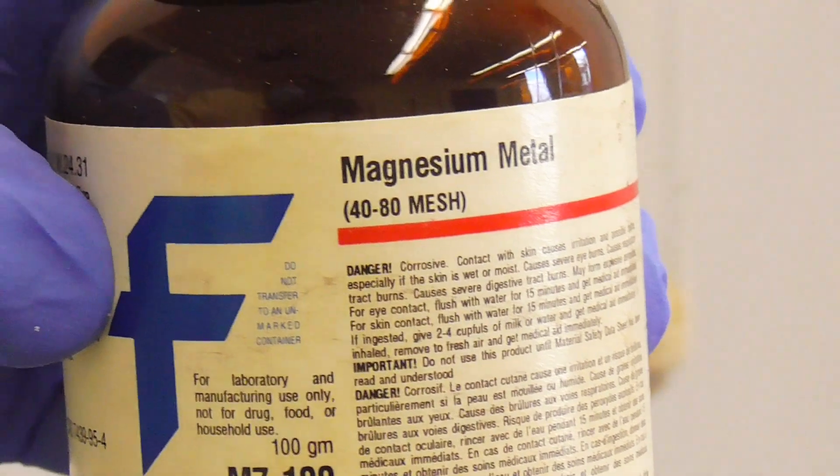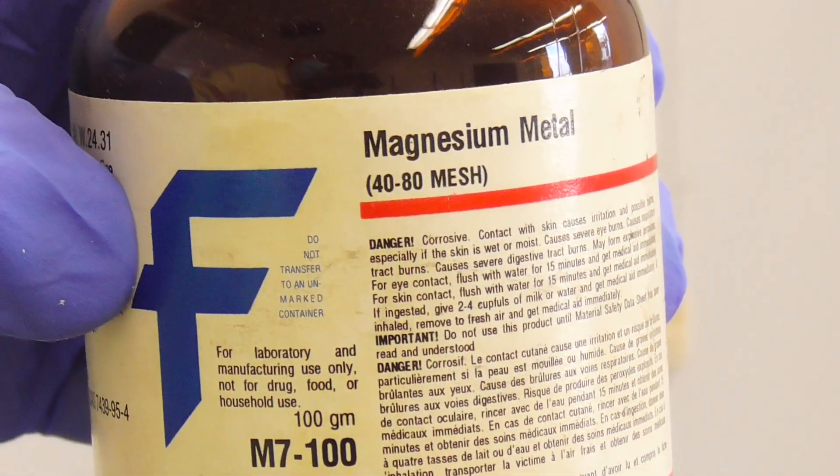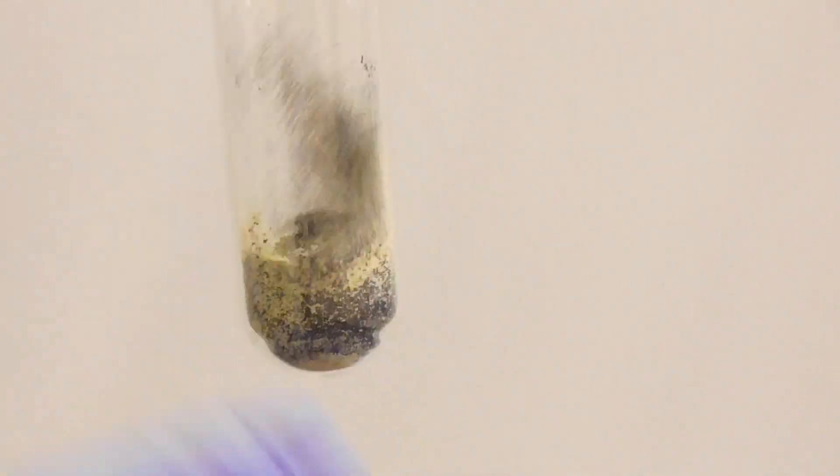I'm going to try to extract the element silicon from sand using magnesium metal. First, I'll add some granular magnesium metal to the sand in this test tube. After shaking the test tube to blend the contents, I'll heat the mixture with a blowtorch.